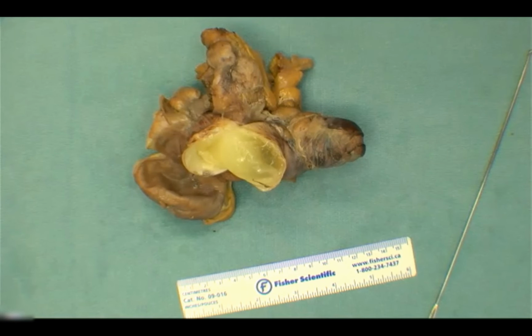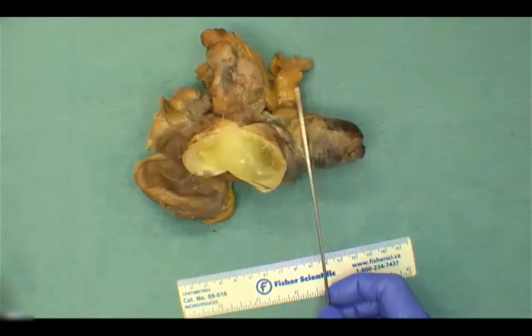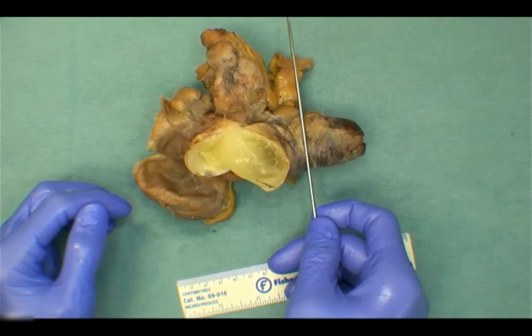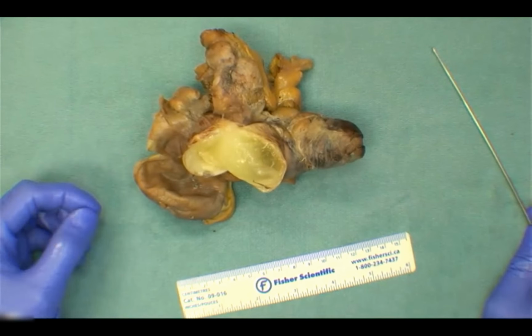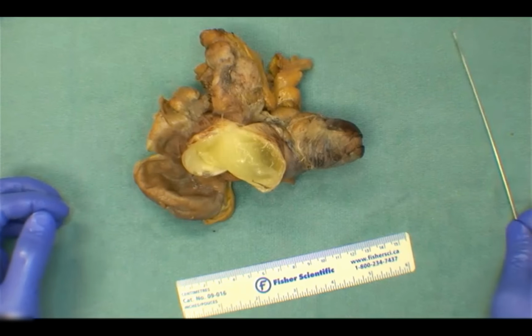What do you do with the tip? Please explain. Yeah, so I think with the tip, we'd still approach it the same way you would on a regular appendix, where you would try to bivalve it, but I would dissect the tip from here and then change my cuts to go perpendicular. And you won't get a nice intact bivalve tip like you would in a regular appendectomy sectioning, but the approach would be the same.